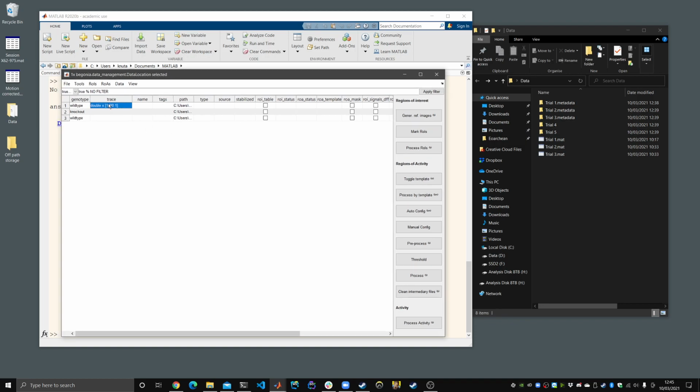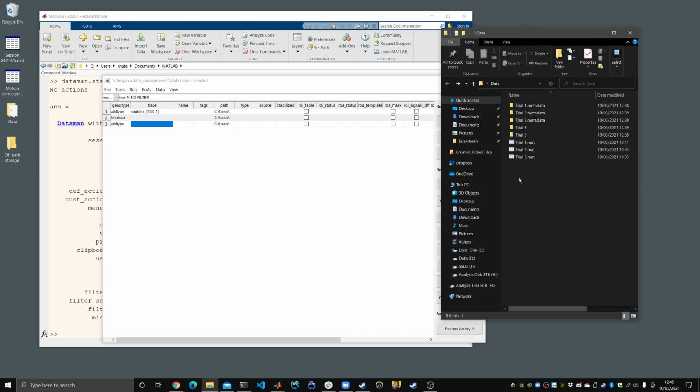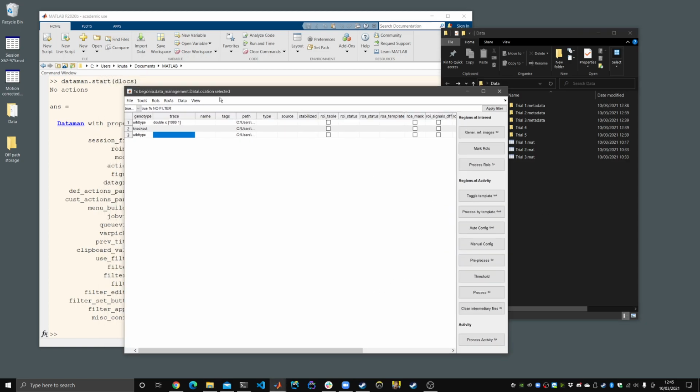There's one additional thing, and we'll look into that in a later video, and that is that once you have data stored like this, once you have things in data locations, you can change from on path to something we call off path, and then you'll take that metadata and put it somewhere entirely elsewhere on your file system, perhaps on another external faster drive, for instance. Let's say you have thousands of recordings. They are really heavy, several terabytes. Maybe you don't want to have access to that disk all the time. Then you can take the metadata and put that on a faster SSD disk using something we call the off-path engine. We'll do a video on that later, but for now, just remember that data locations are metadata.